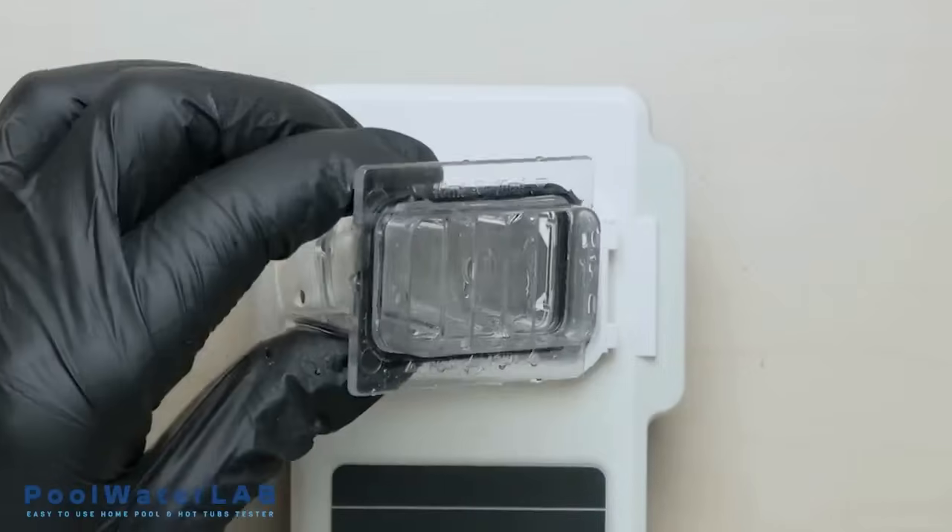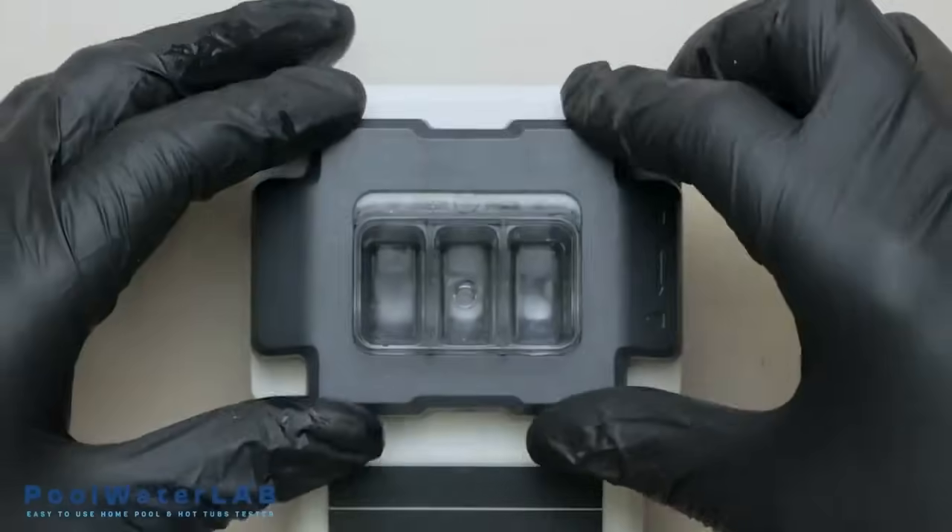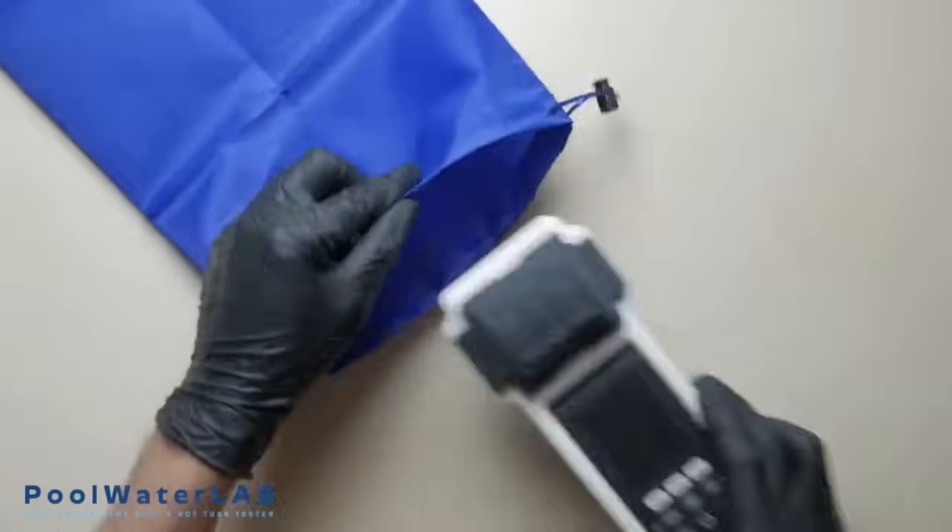Wipe the cuvette dry with a clean cloth. If you have finished testing, pack your tester into the bag.